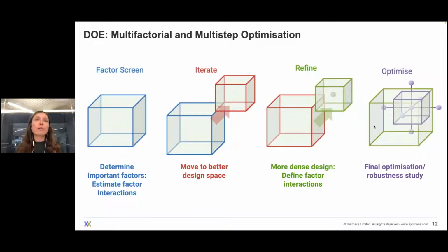However, there are many flavors or types of DOE design, which are based on your ultimate objective. And despite how powerful DOE is, it doesn't necessarily mean you just run one experiment and be done with it. It's still a very iterative approach, similar to the OFAT approach in this sense, at least.